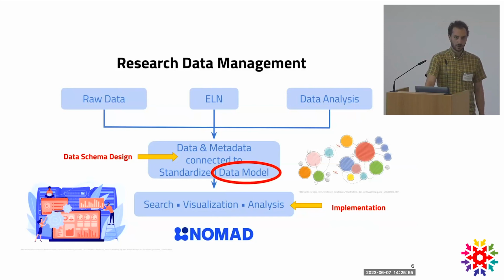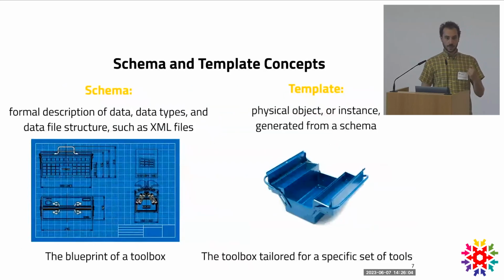Before going on, there are some basic concepts concerning the data model and what we need to do as the first steps to start doing that. And as also Marcus mentioned before, it's important to have a schema that is just a conceptual description of the structure of our data. I'm using here the metaphor of the toolbox just for saying that the schema is just the blueprint or the project of our toolbox.